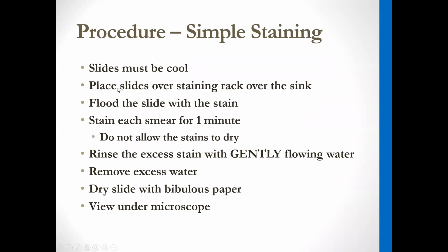you are going to place the slides over this little staining rack that you can have over a pan or over the sink, so you can pour a bunch of stain, whether it be methylene blue or safranin or crystal violet, and completely soak the slide, and then you wait. It's normally 30 seconds to 1 minute that is sufficient.